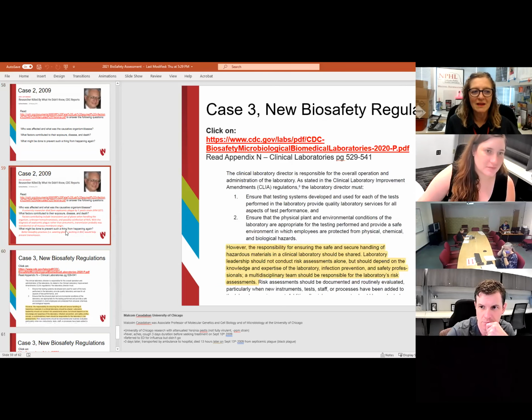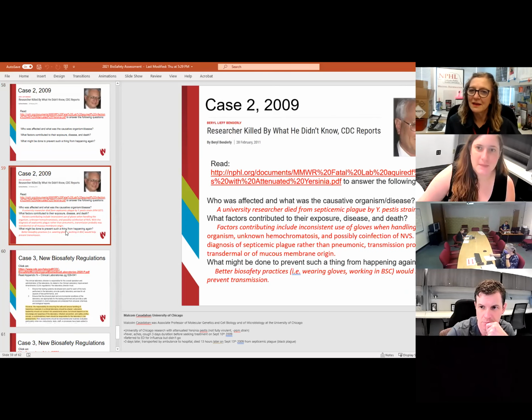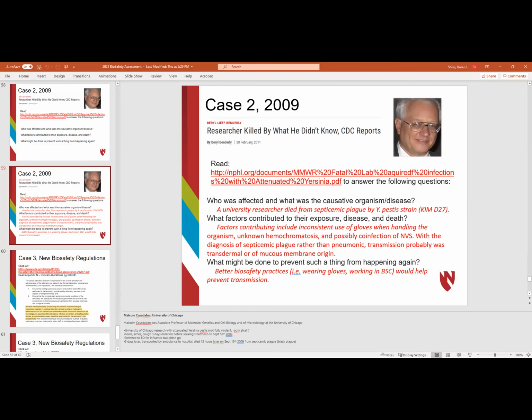I think one other thing just to mention is always being cognizant to wash your hands before you leave the lab space after handling any organisms. Even if you had gloves on, it's just best practice anytime you're done and you're getting ready to leave the lab or switch job tasks is to wash your hands. Yes, and very true. So thank you for that information.